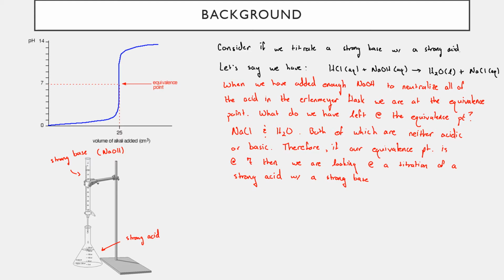Another thing I should mention is that when we look at that equivalence point, you see it's in the middle of the sharpest slope upwards in our titration curve. And so it's always at the very center there. Another way that we can recognize it is that on the left-hand side before the equivalence point, the curve curves in a counterclockwise fashion if we were to draw it.